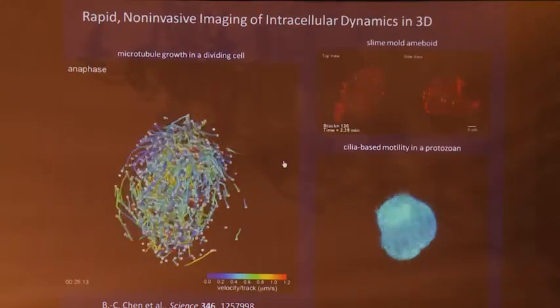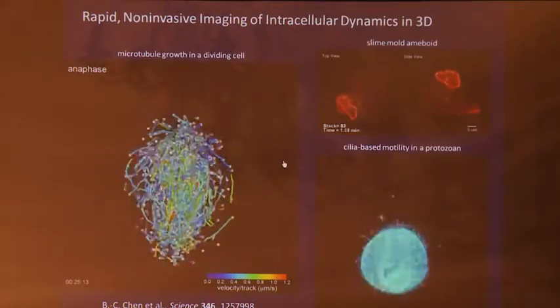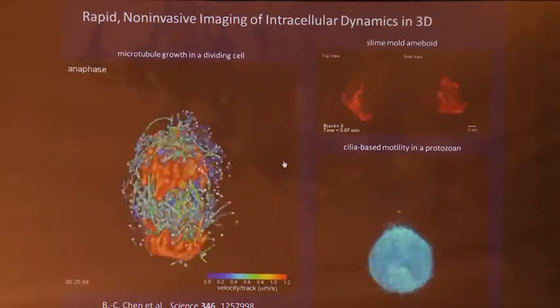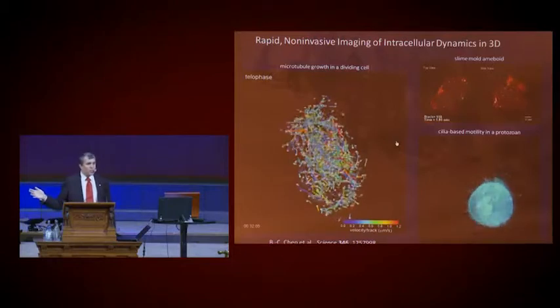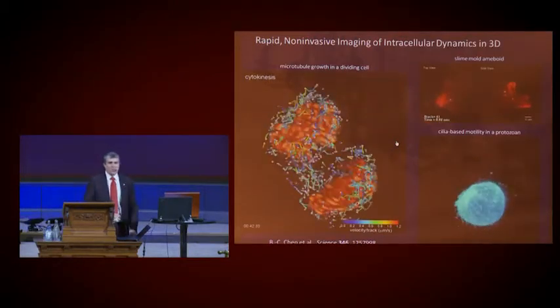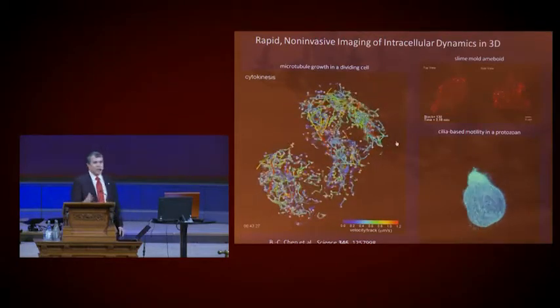And so what we were able to show is that the velocities of microtubule growth increase as you go through metaphase and then slow back down again to cytokinesis. And this also represents the low phototoxicity, because you're looking at 500 volumes in each of 2 different colors. Both volumes are collected in 1.2 seconds, and so a total of 1,000 volumes from the same cell. It's going through all the mitotic checkpoints when the cell is super sensitive and would otherwise arrest, and is perfectly happy.